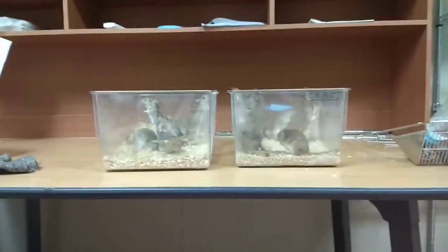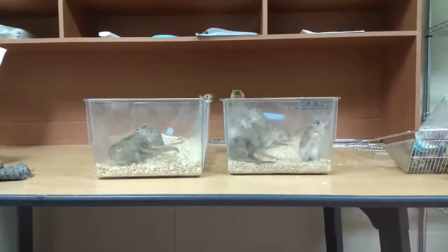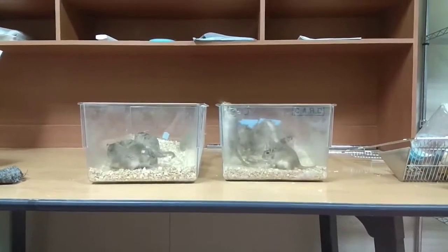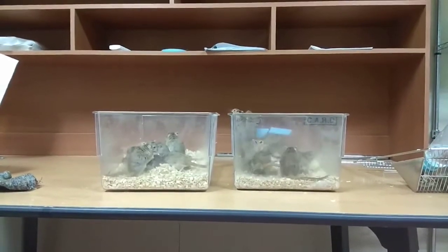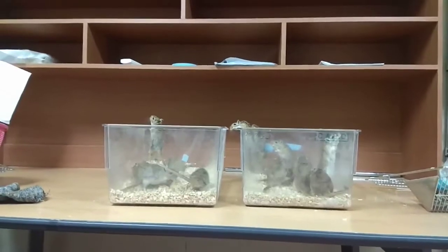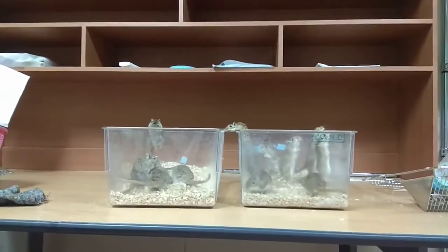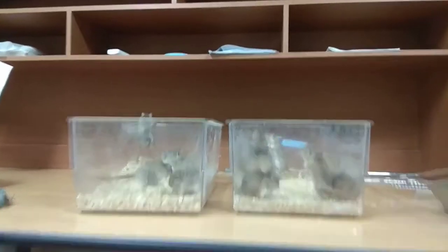Hello everyone, today I am going to show you how to differentiate male and female gerbil. For our experiment, sometimes we need male gerbil and sometimes female gerbil. So it is important to differentiate male and female gerbil, and it is also a little bit difficult.